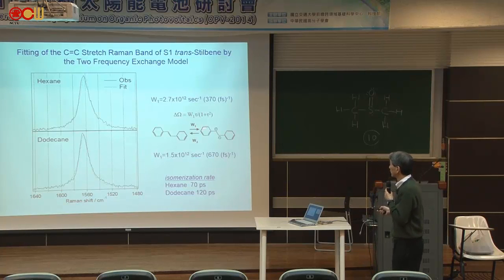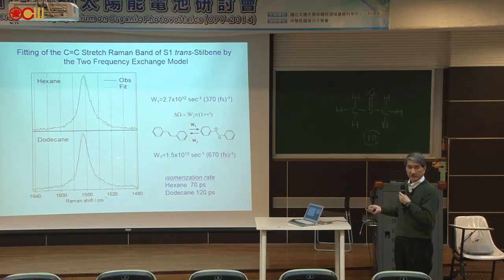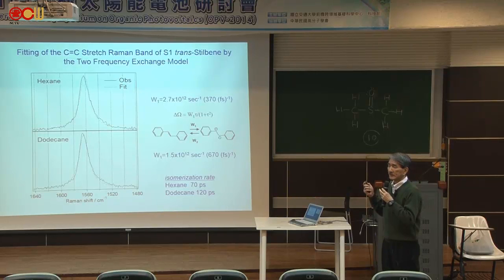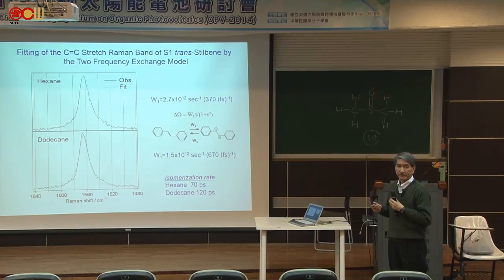So if this polarization occurs, and if the bond stays in a single bond condition for long enough, then it rotates. But it mostly comes back. Okay? So apparently, by looking at Raman spectroscopy, it's a double bond, but for some time it polarizes into a single bond, and then the reaction can occur.